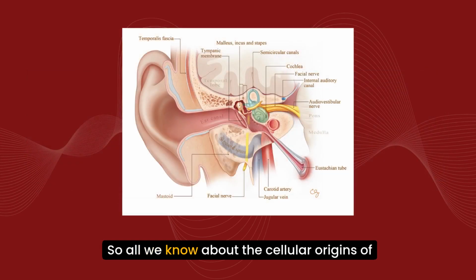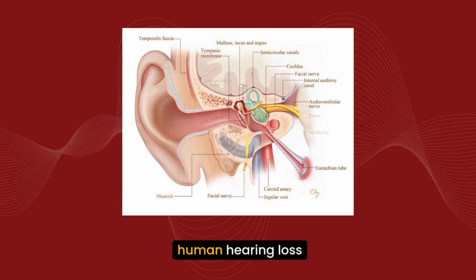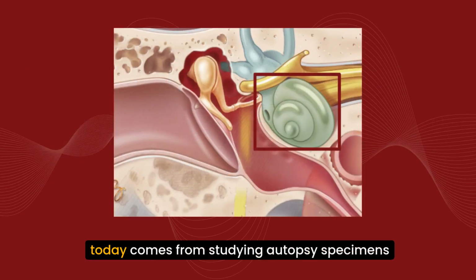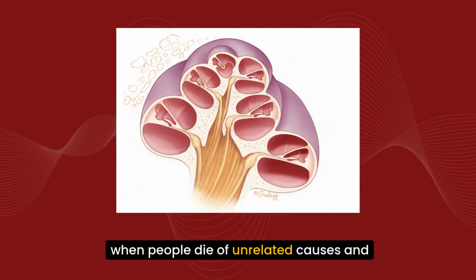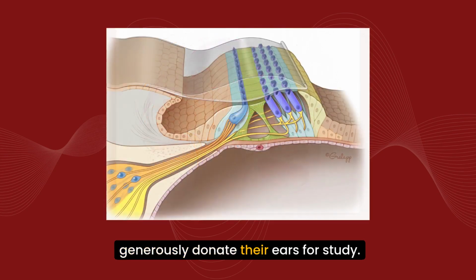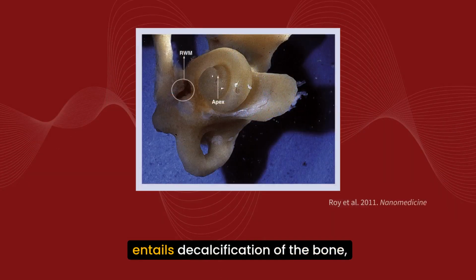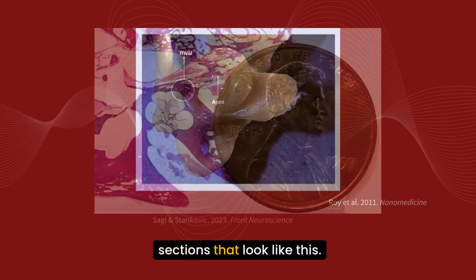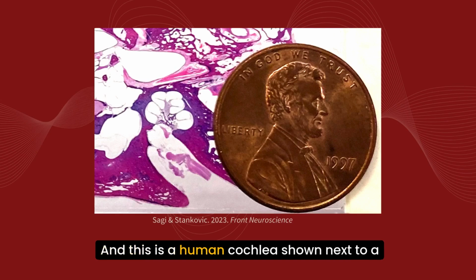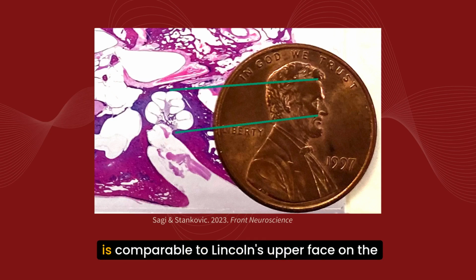So all we know about the cellular origins of human hearing loss today comes from studying autopsy specimens when people die of unrelated causes and generously donate their ears for study. So then, through a laborious process that entails decalcification of the bone, embedding and sectioning, we can generate sections that look like this. And this is a human cochlea shown next to a penny. And you can appreciate that the size of the human cochlea is comparable to Lincoln's upper face on a penny.